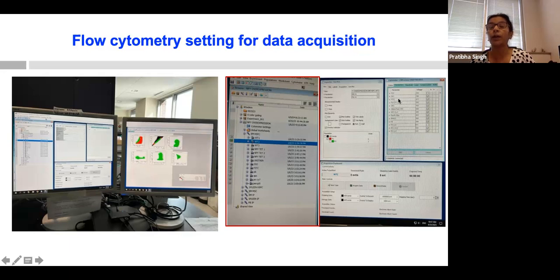For fluorochromes, like all these fluorochromes that we have, almost 99% of the time we work in log scale. So we have to check these boxes so that it can acquire data in the log format. But there are some exceptions. If we are doing cell cycle analysis, in that condition we should uncheck this box. Suppose we are using DAPI, which is similar to Pacific Blue. We have to uncheck this log box and it should be just linear.